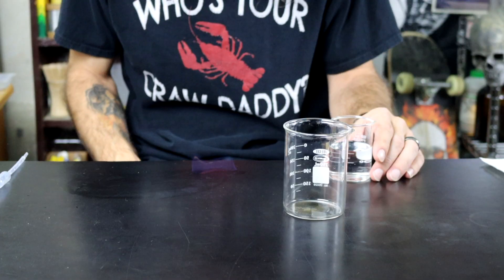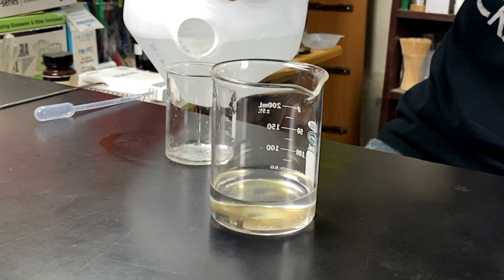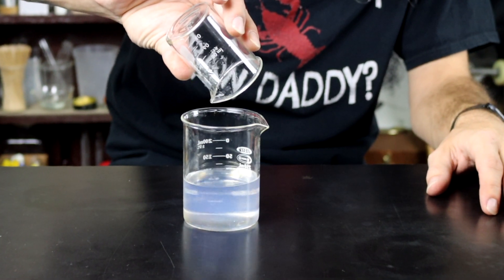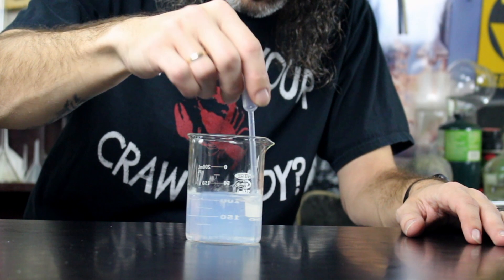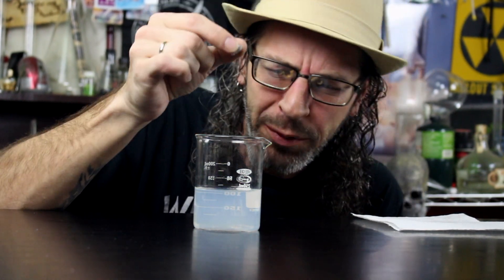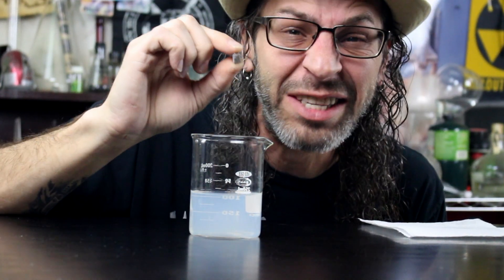Yes, it burns. Here goes nothing — a nice little chunk of sodium right into the beaker of alcohol and water. It's about a 50/50 mixture: 50% ethanol, 50% water, and some sodium.